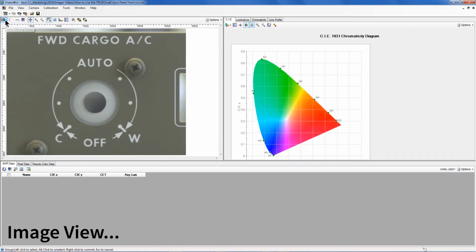Luminance values can be individually assigned, or an auto-range feature automatically assigns luminance based on the entire image or a selected AOR. Note how pointing to the color scale displays the luminance range for any given color.